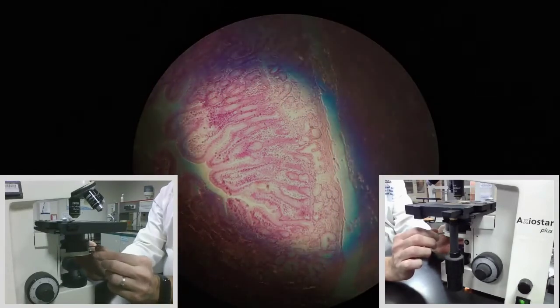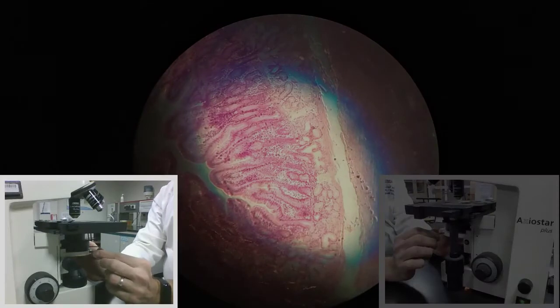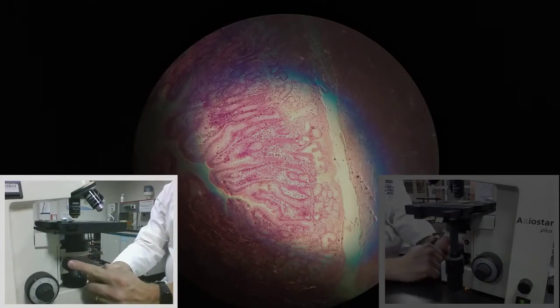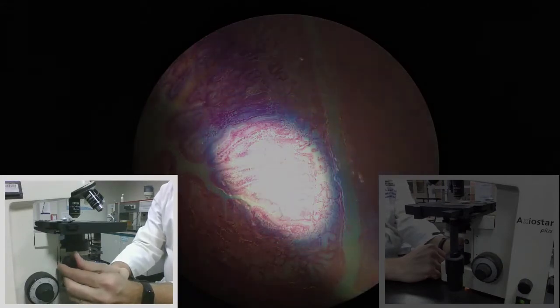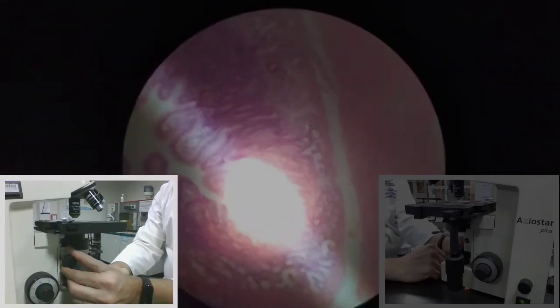That's what I'm seeing right now in the field of view, but it's not very focused. So what I'm going to do next is focus the condenser lens. To do that, I'm going to use the condenser lens focusing knob on the side. You'll see there's a coarse focus and a fine focus knob, but right next to it is also a condenser lens assembly focusing knob. This knob is going to allow me to get this into better focus.